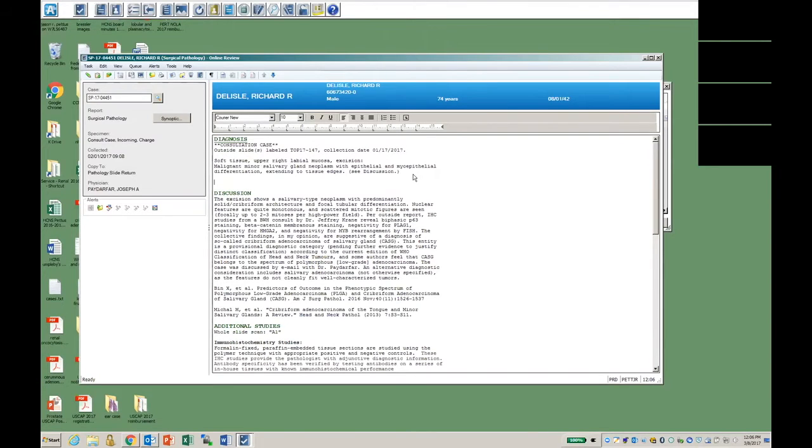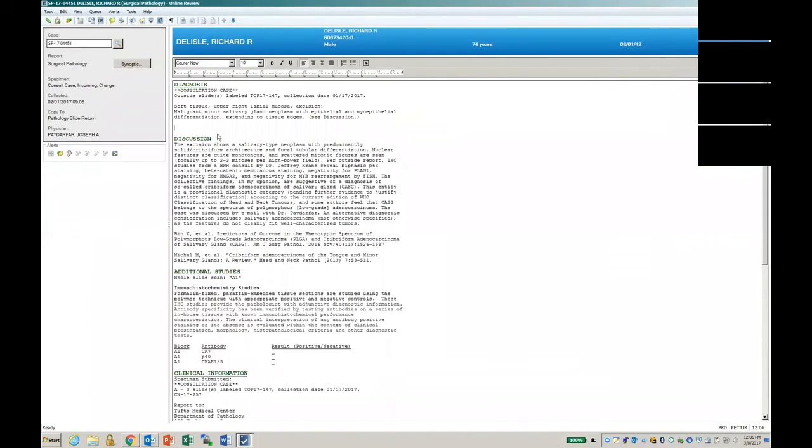Okay. At any rate, so this is the routine diagnostic field. You know, we've called our comment session, et cetera. So I'm assuming this looks fairly similar to your workflow in PathNet. And just so I know, have you guys used the prior Cerner Synoptic tool?